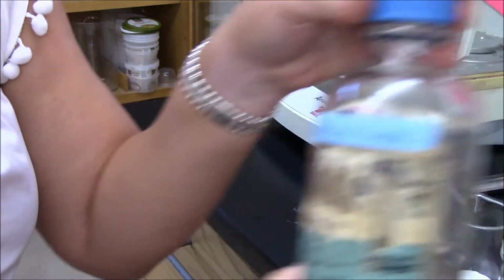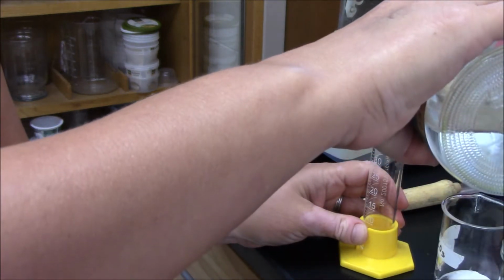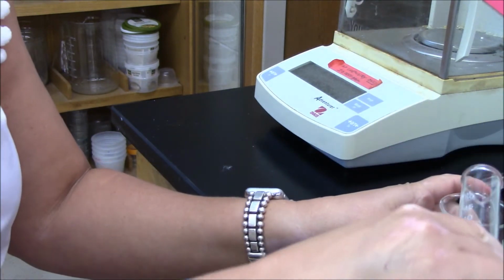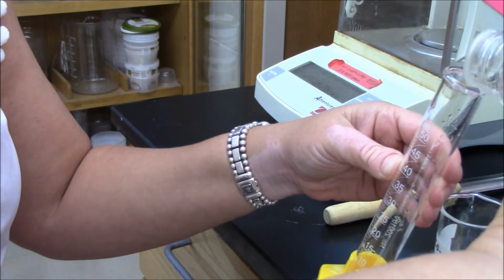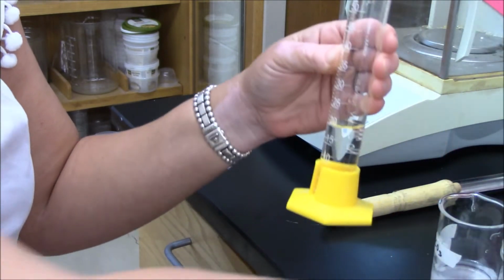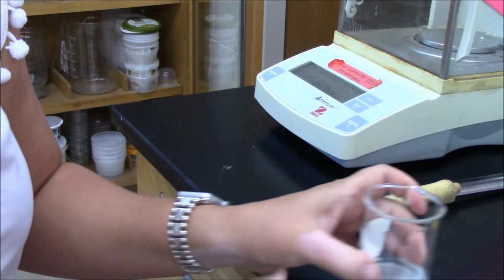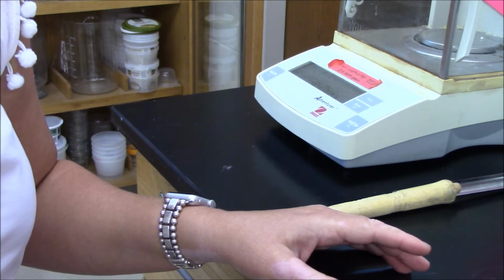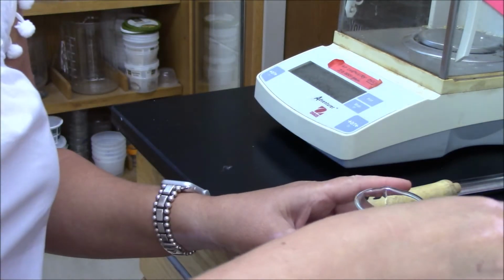In the next step, I'm going to take some deionized water, and to each beaker I'm going to add about 20 milliliters. Again, about is not an exact value, it's an estimate. This is close to 20. And then in the second beaker, which has calcium chloride, I'll add 20. All right. And now I'm going to stir and observe. It's going to take a moment for everything to dissolve.